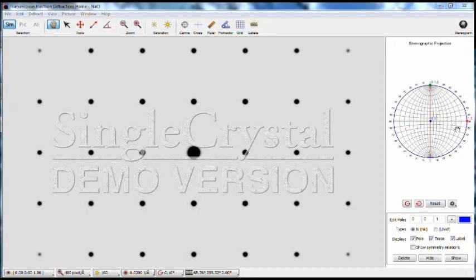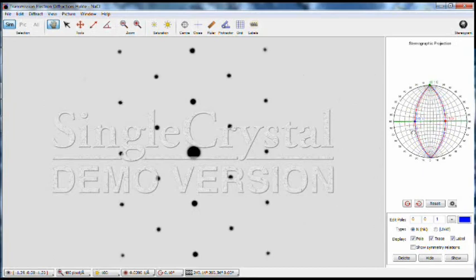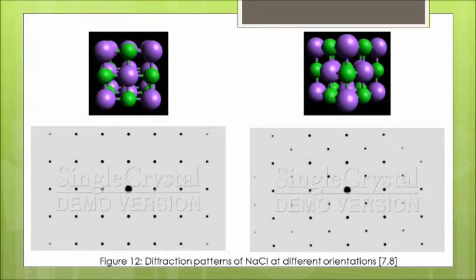For a crystalline structure, bright diffraction spots will appear, each corresponding to a different satisfied diffraction condition of the crystal structure or lattice planes. Notice that the diffraction spots appear and disappear as you tilt the sample. That is because different lattice planes have come into play, and the diffraction conditions have been altered. So a single crystal will be able to have more than one set of diffraction spots from different orientations.